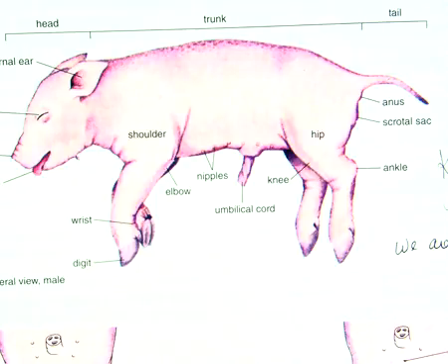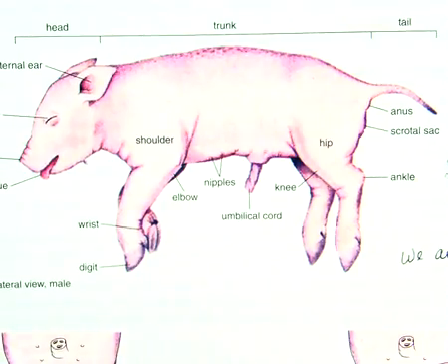Okay, so this video is part of exercise 26 from the old book, Basic Mammalian Anatomy. Now in our last instructional lab together, because we don't get to do a lab for ecosystems and conservation biology, unfortunately, we want to take a look at the basic anatomy of mammals. And a pig is a great model organism. Again, model meaning that we can use it to help us understand us.